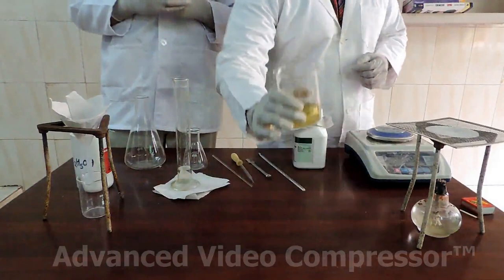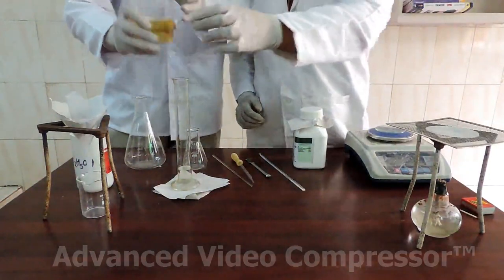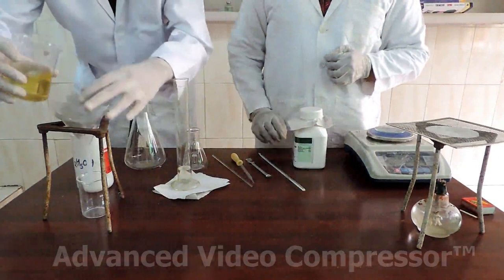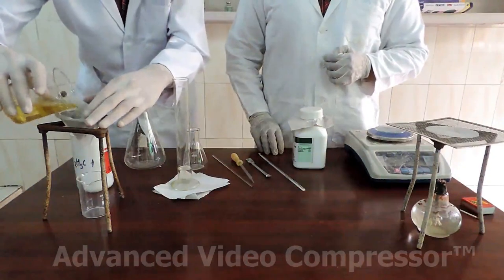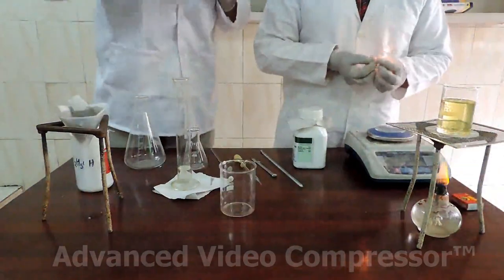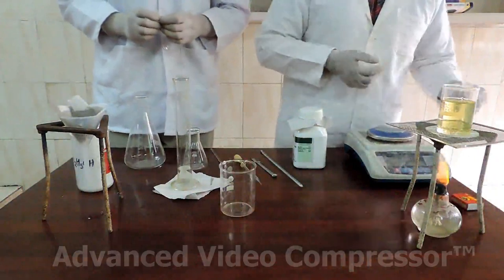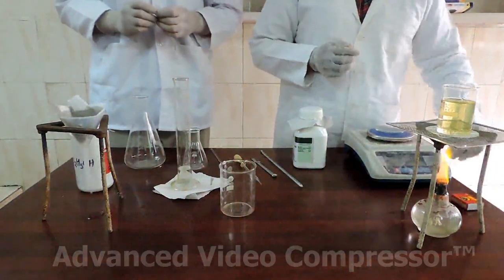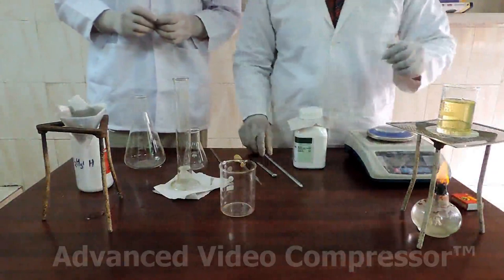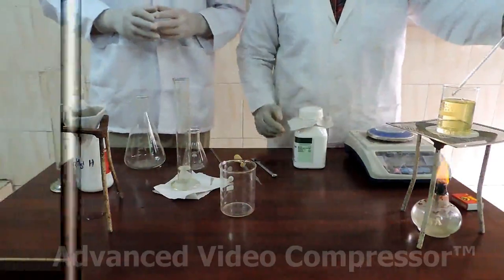This is 100 milliliters of used cooking oil which we are going to filter in order to remove any impurities present in it. The next step is heating the oil to 60 degrees Celsius which should be monitored using a thermometer.